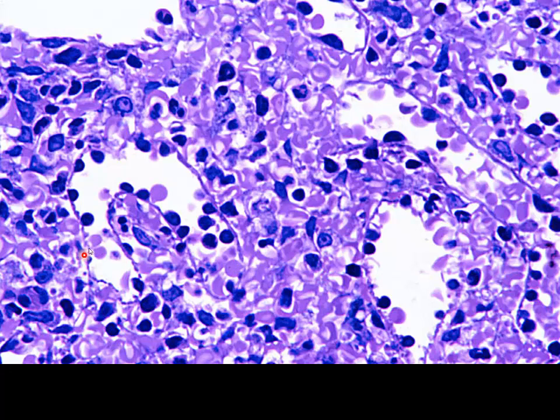Here's two trying to get out. There's one sort of in midstream, and we can see that throughout all of these splenic sinuses. These red blood cells are going out into the space that's the cords of Billroth. We're going to have other sinuses that collect these in sort of an open circulation way, draining them into the venous system to get them out of the spleen and back into the circulation.